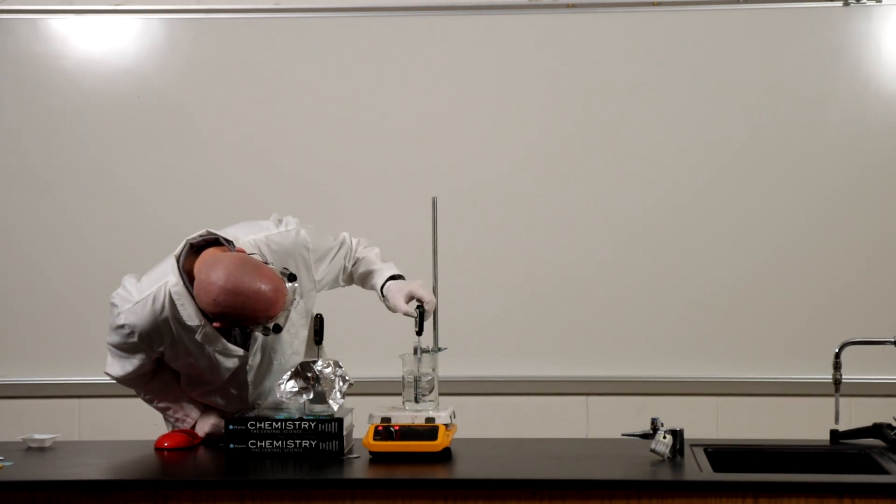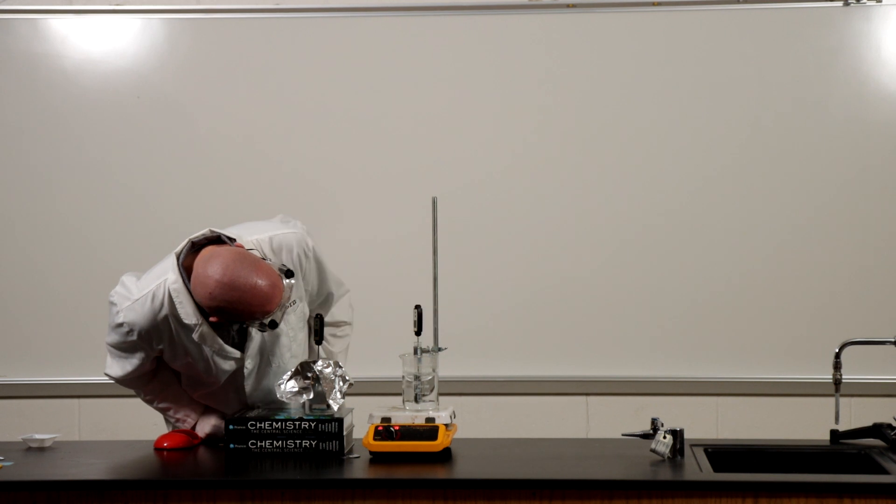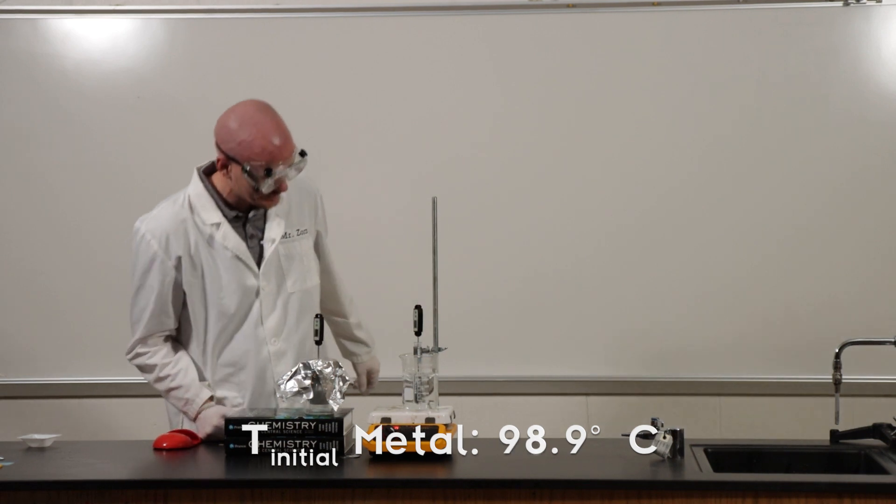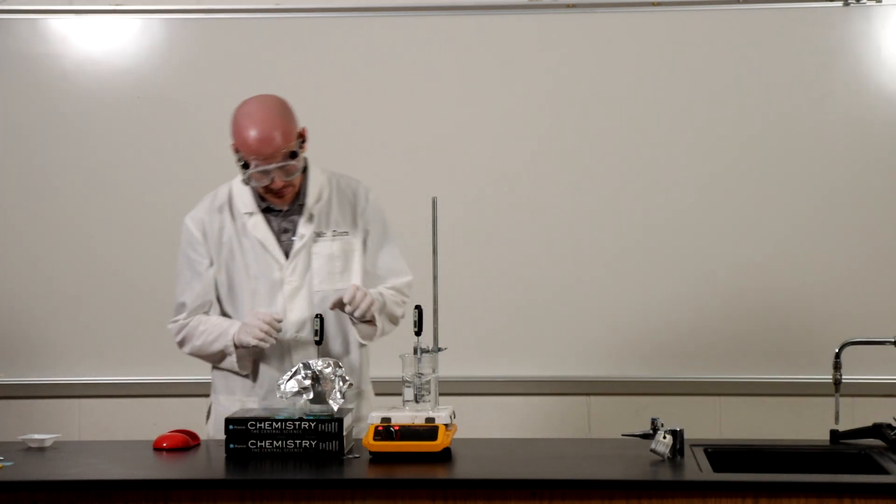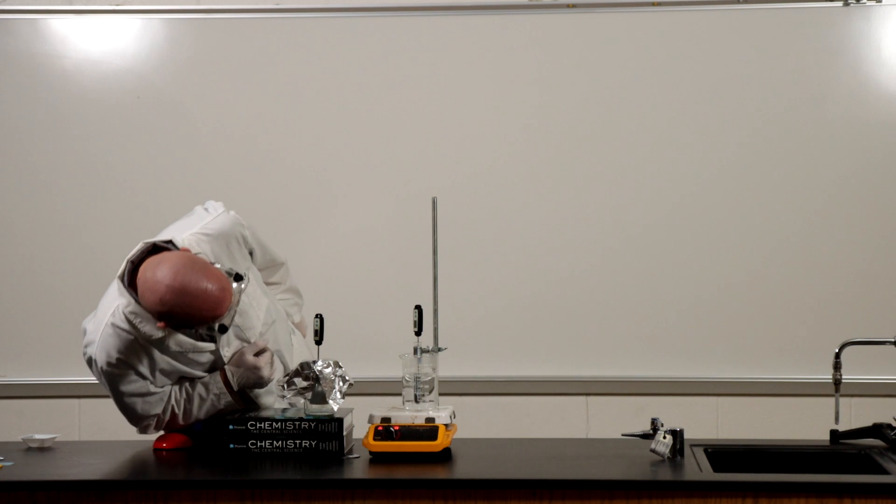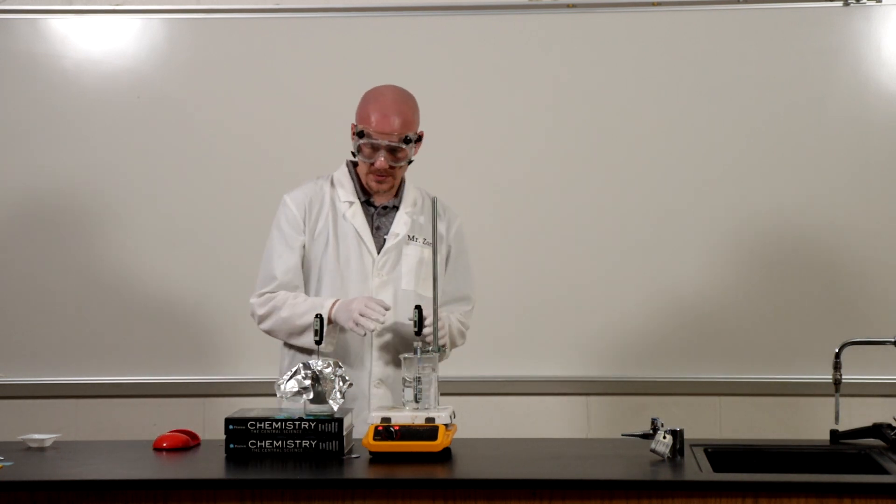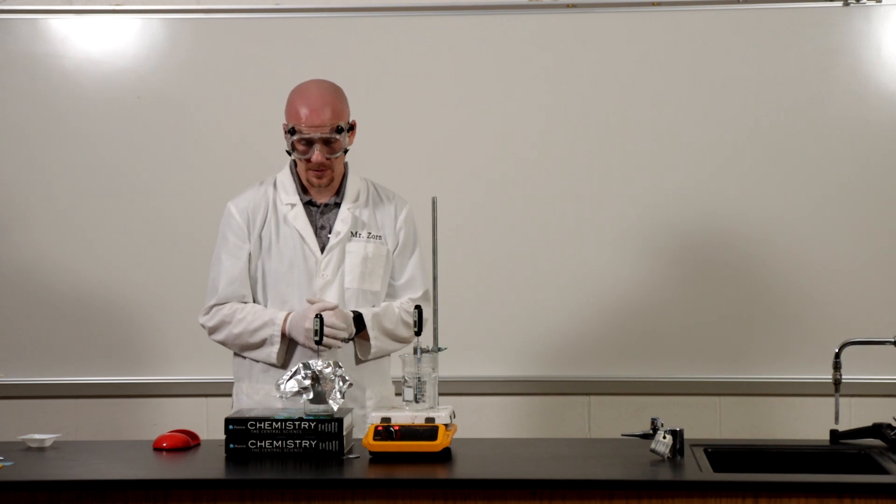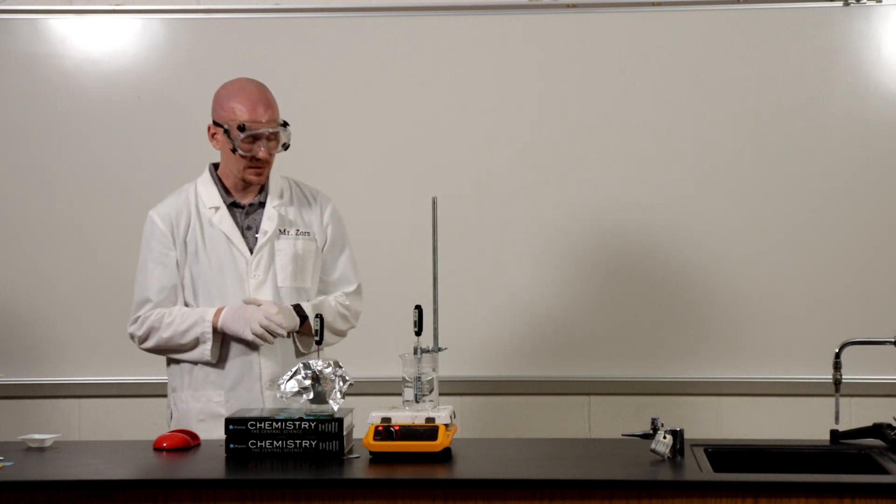The initial temperature of our metal, 98.9 degrees Celsius. So 98.9 degrees Celsius and the room temperature is 20.4. So what I'm going to do is I'm going to remove the metal and I'm going to quickly place it into the calorimeter here and we're going to watch that temperature increase.